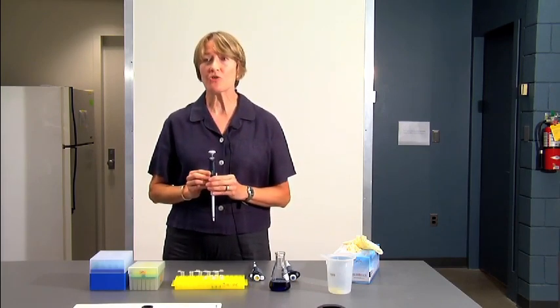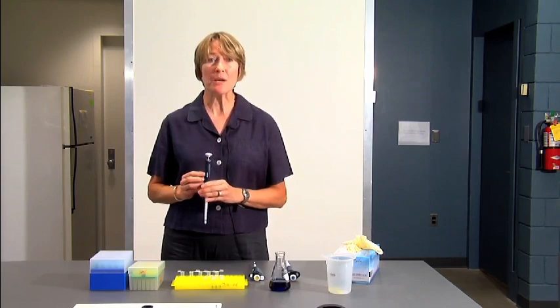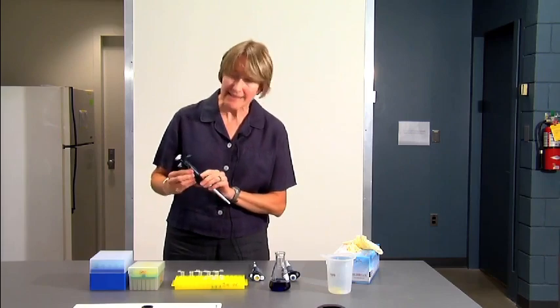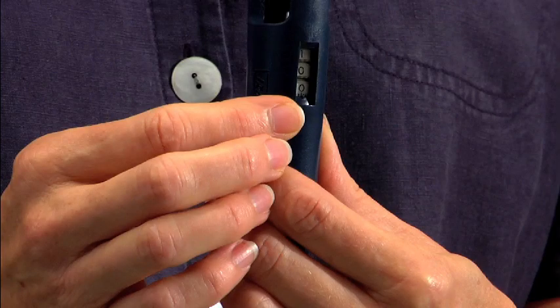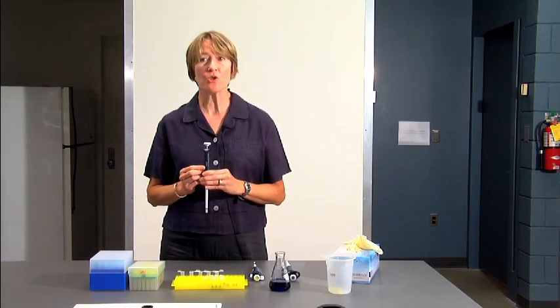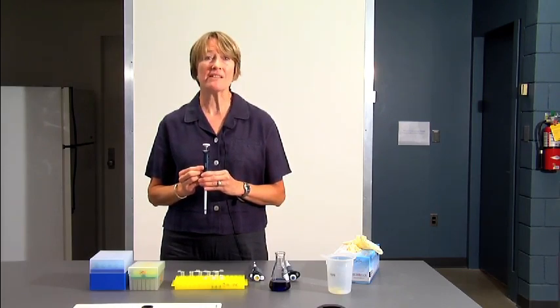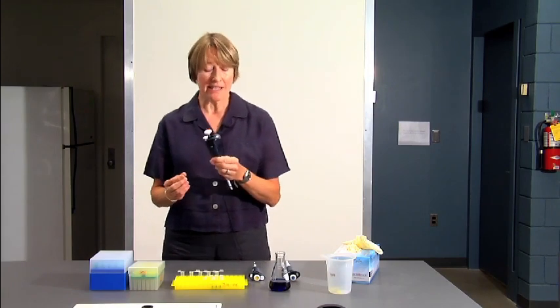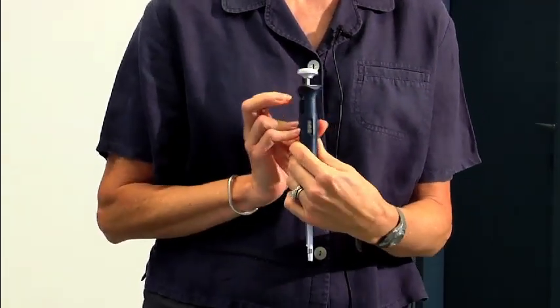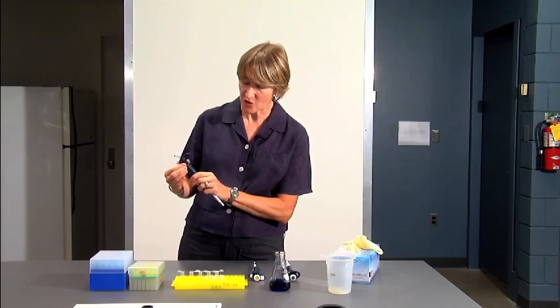We'll start with the P200 first because that's the easiest one to set. On the P200, you have 3 black numbers on the dial, and essentially what you see is what you get. If the pipetter is set at 100, that will measure 100 microliters. If you wanted 200 microliters, you would set it at 200. 50 microliters would be 050. To set the pipette, you turn the barrel until the numbers appear in the window for the volume that you want. So I'm going to set this at 100 microliters, or 100.